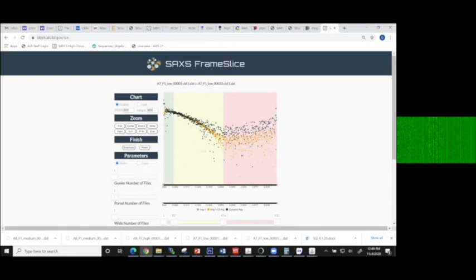So what we're looking at here is protein 1, and we're seeing the scattering from it. The black dots are from the very first exposure, and the orange dots are all 33 frames put together. Now this is an extremely low concentration result, so it's not ideal. And what we're looking for here is how many frames we could use before radiation damage takes hold. So it's divided the data into 3 regions, sort of a Neapolitan coloring: mint, vanilla, and strawberry.